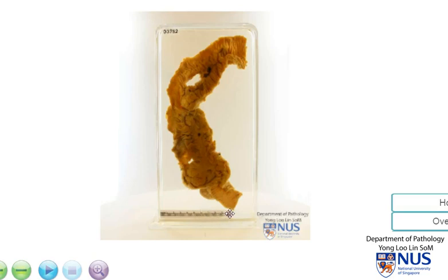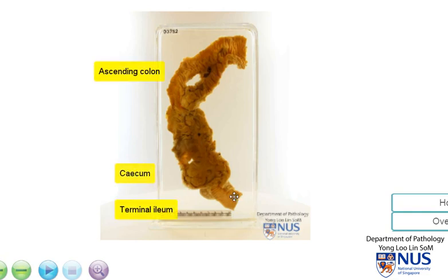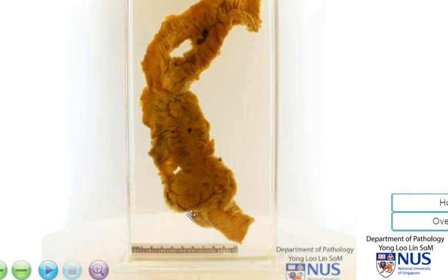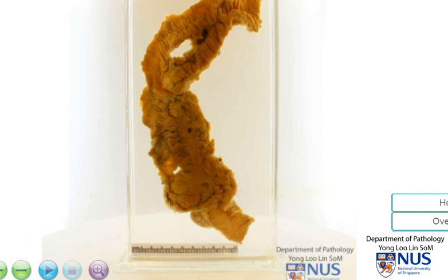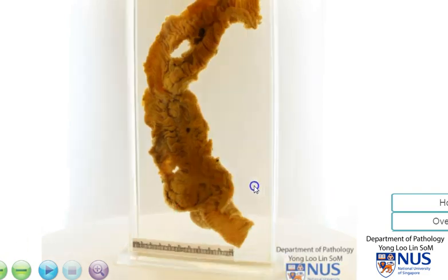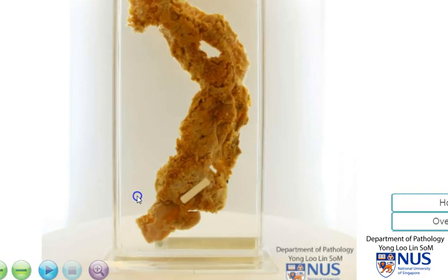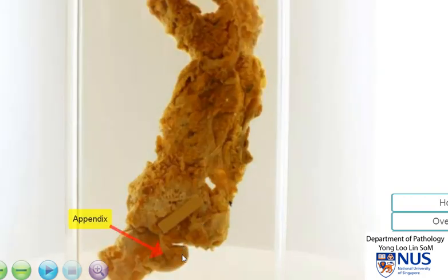Here is a specimen of the proximal colon — the ascending colon, the cecum, and the terminal ileum. We can recognize this because we can just about make out the appendix here. This is the region of the ileocecal valve. Let me rotate this and we can just see that this part is the appendix.